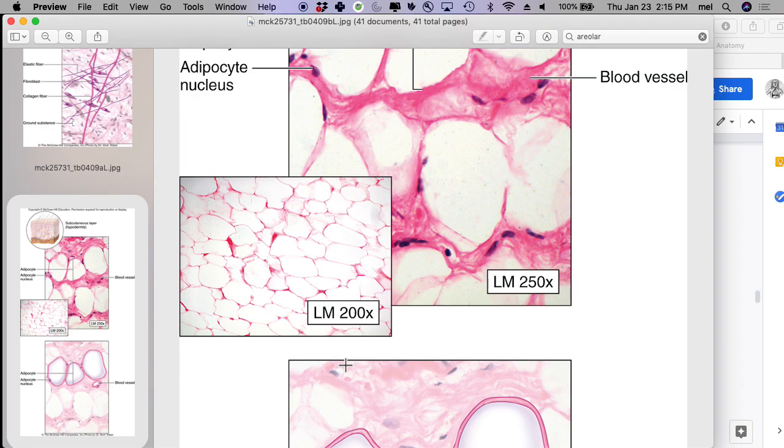Adipose tissue is really loose areolar connective tissue plus a whole bunch of cell division in your adipocytes. So it starts out looking like loose areolar connective tissue. It's got fibers, it's got some other cells right here, like different kinds of fibers, right? And then you had puberty, right? You hit puberty and you didn't used to have any hips, but then you get some, right? Okay, so you hit puberty and you had a few of these big adipocytes.